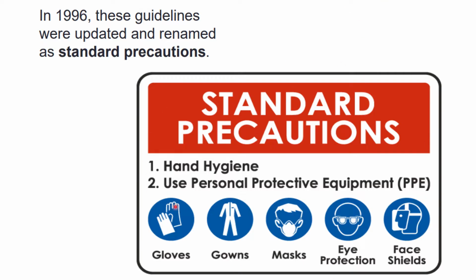As you can see from this diagram, it's placed here as five, but the four standard precautions include hand hygiene, the use of personal protective equipment such as gloves, mask, and eyewear, also respiratory hygiene or cough etiquette, and sharps safety that includes engineering and work practice controls.